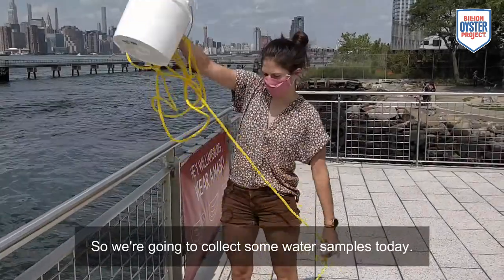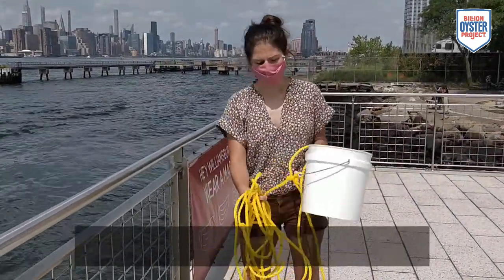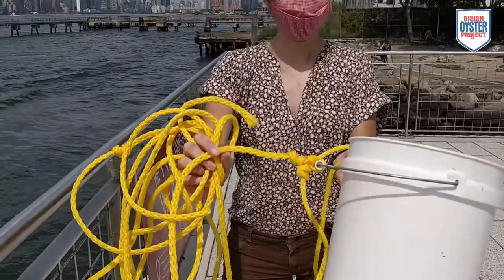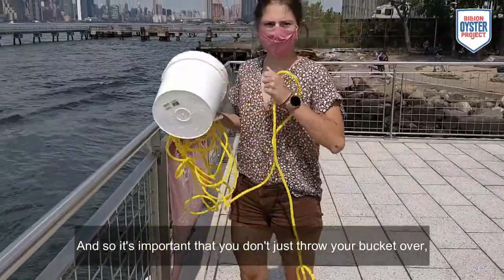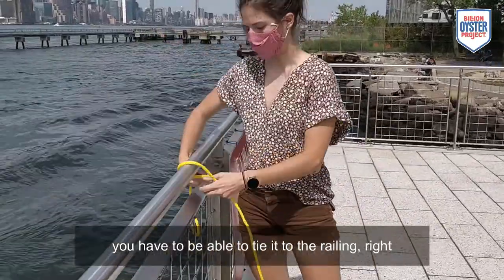So we're going to collect some water samples today. Make sure you have a bucket and you have a line, and the line is attached to the bucket really well. It's important that you don't just throw your bucket over. You have to be able to tie it to the railing.